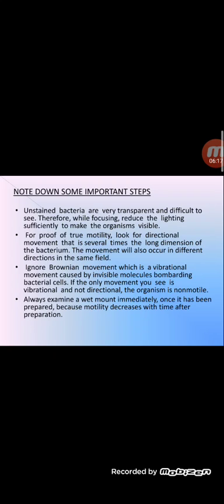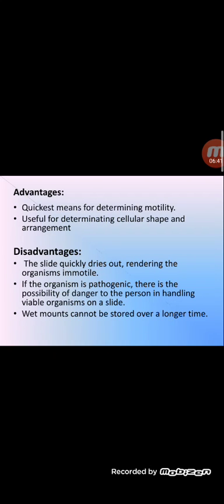And next thing is, always examine the wet mount immediately once it has been prepared, because the motility decreases with time after the preparation. So the wet mount preparation should be examined immediately after the preparation, or it will decrease the motility of that organism.